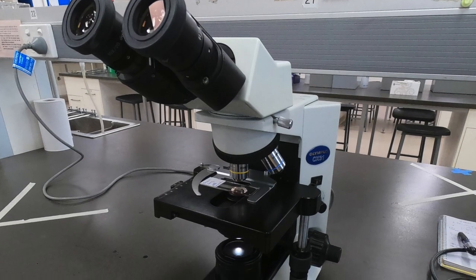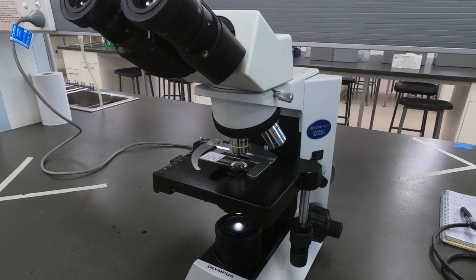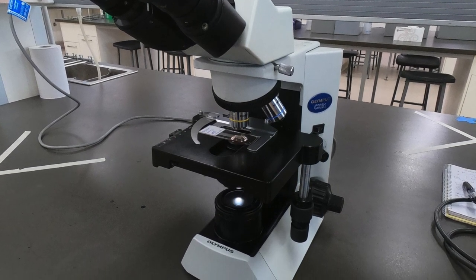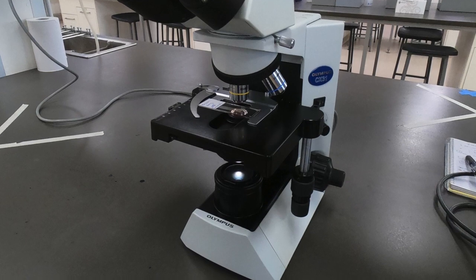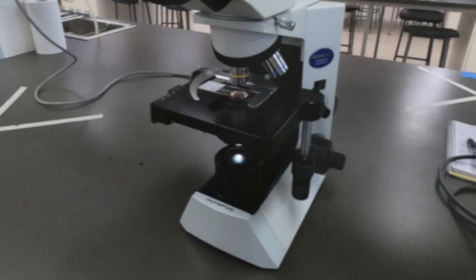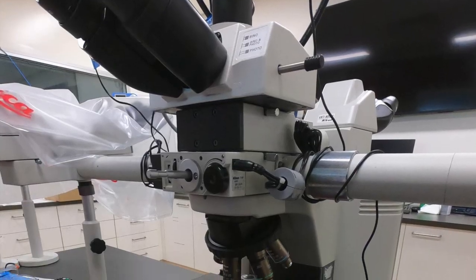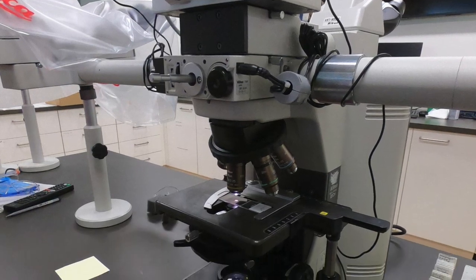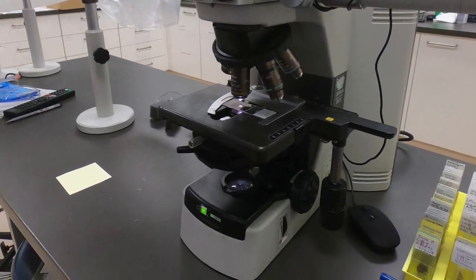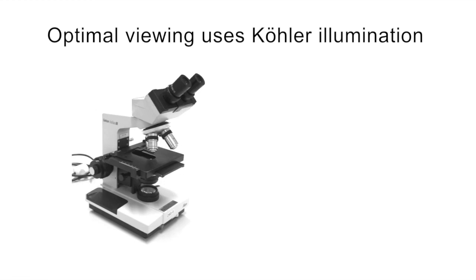With so much attention being paid to correct staining technique, we can sometimes overlook the need to have our microscope set up correctly. Whether it's a student microscope or something more sophisticated like this multi-header, optimal viewing of our specimen is achieved in brightfield optics using Kohler illumination.